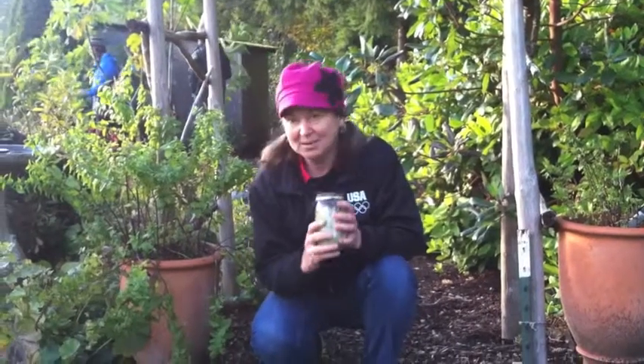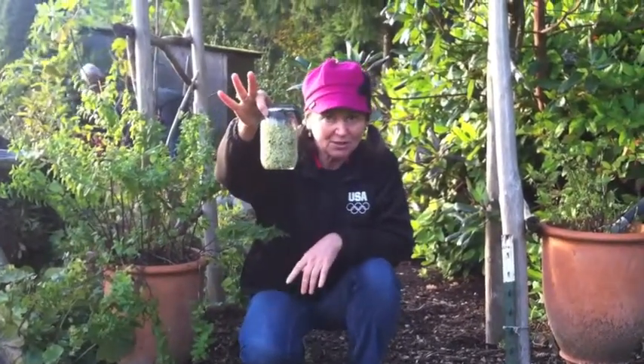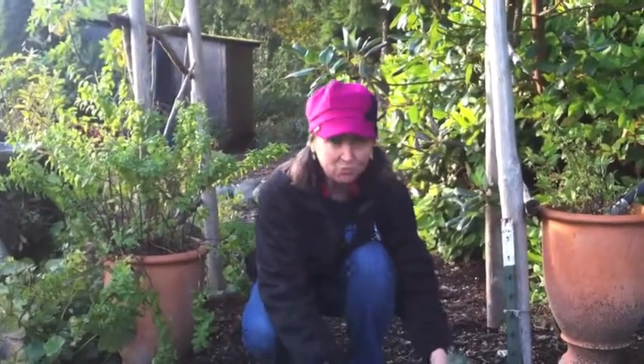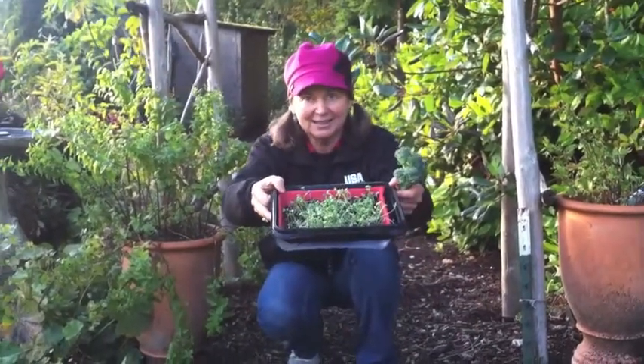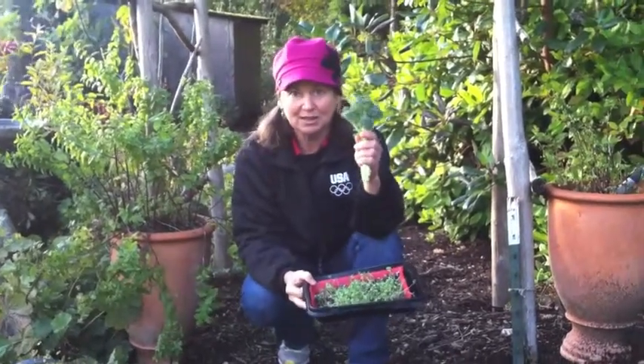Today I'm out at Paul Gauchy's farm, the Back to Eden, and we're going to be testing with his refractometer the mineral content of these different types of broccoli. First of all, I have broccoli sprouts which I sprouted myself, and then we have broccoli microgreens, and then some broccoli that I just picked out of his garden.